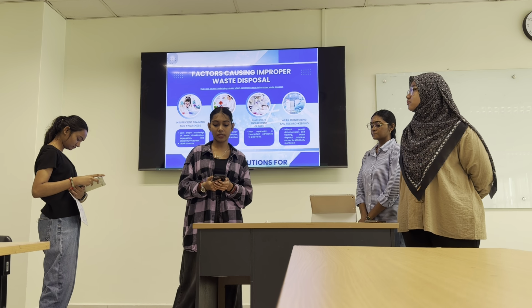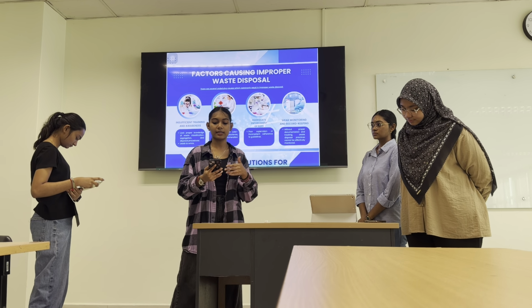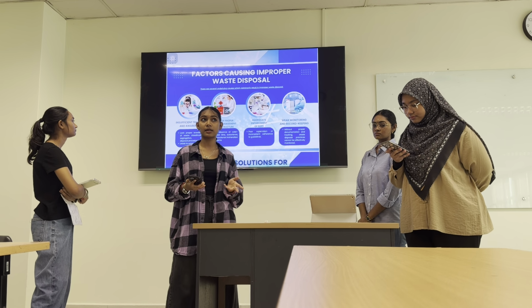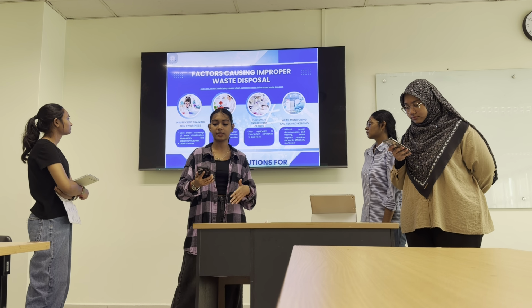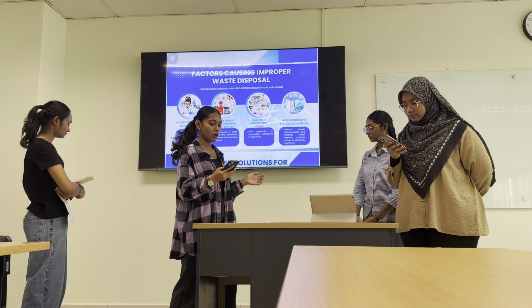Some laboratories don't have facilities like color-coded bins and a functional autoclave. The absence of essential tools like this makes it difficult to handle biological waste safely. Furthermore, there is inadequate enforcement of SOPs.